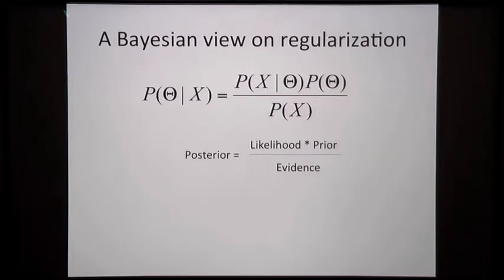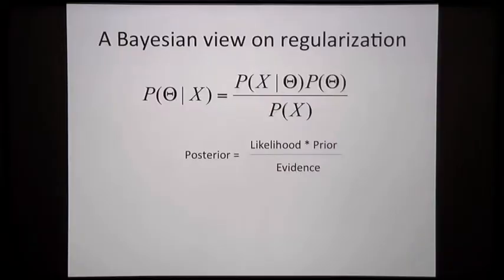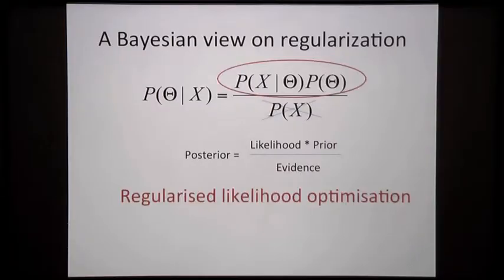Now you can do regularization also in a statistical manner, and that's where Bayes' theorem comes in, because you can postulate a posterior where you actually have the likelihood function that we had before, and we multiply it by some kind of a prior. And the prior means what's the probability of getting a certain model. If I have my data and I want to reconstruct the model, what do I know about models, about reconstructions of EM density for proteins? What do I know about them that could be useful as prior information? Okay, so that's the important question.